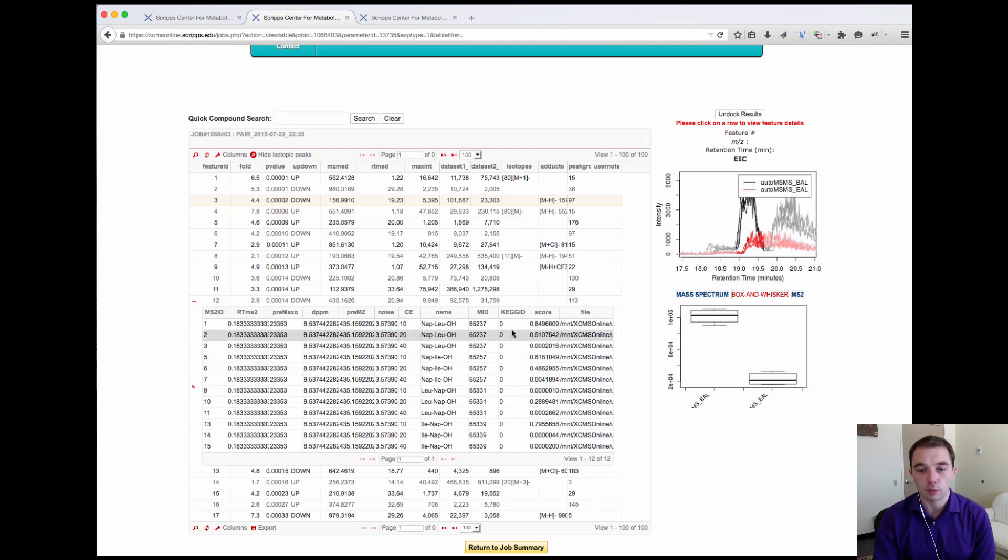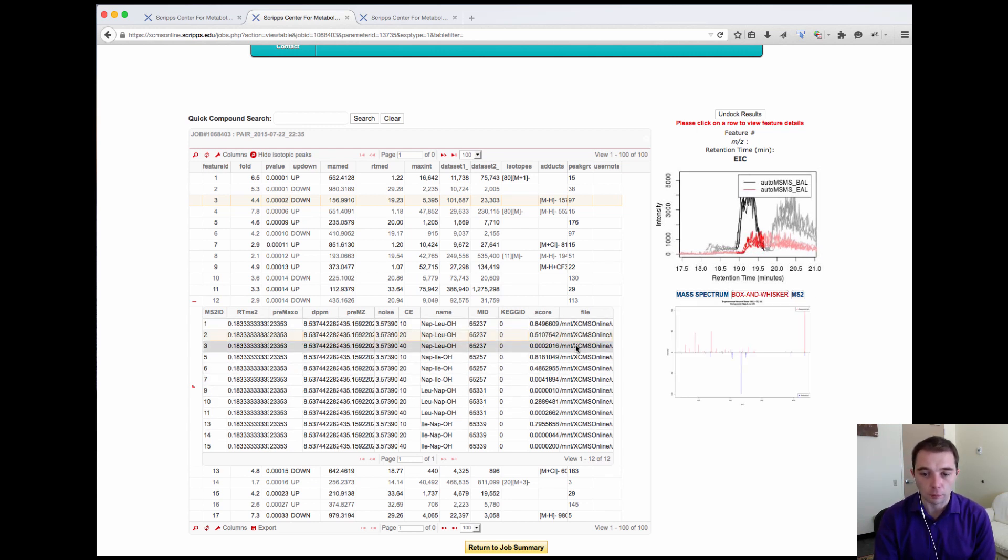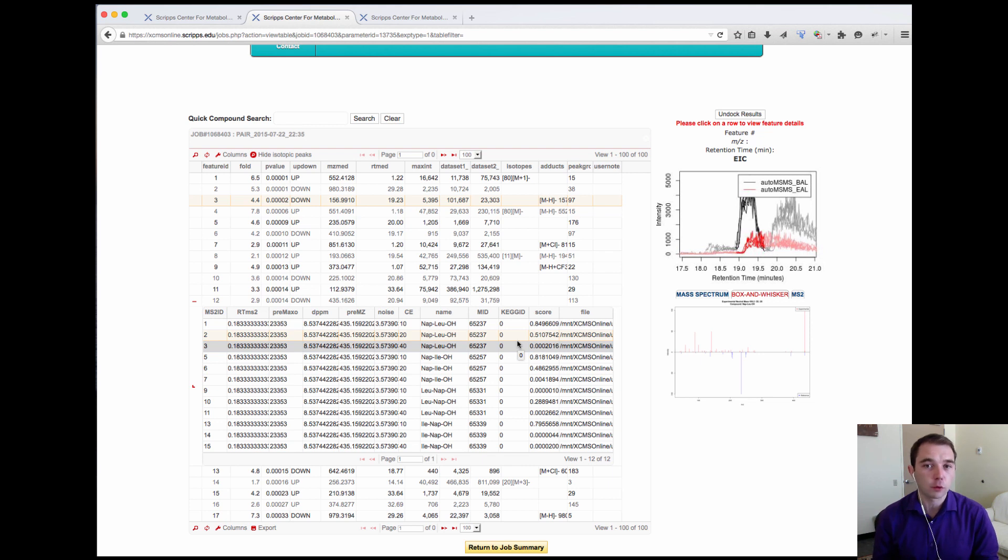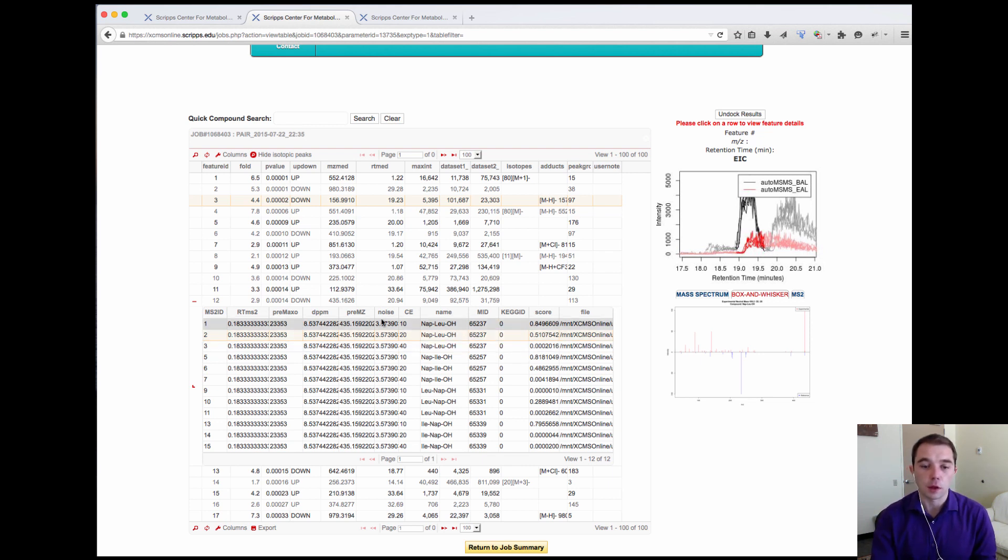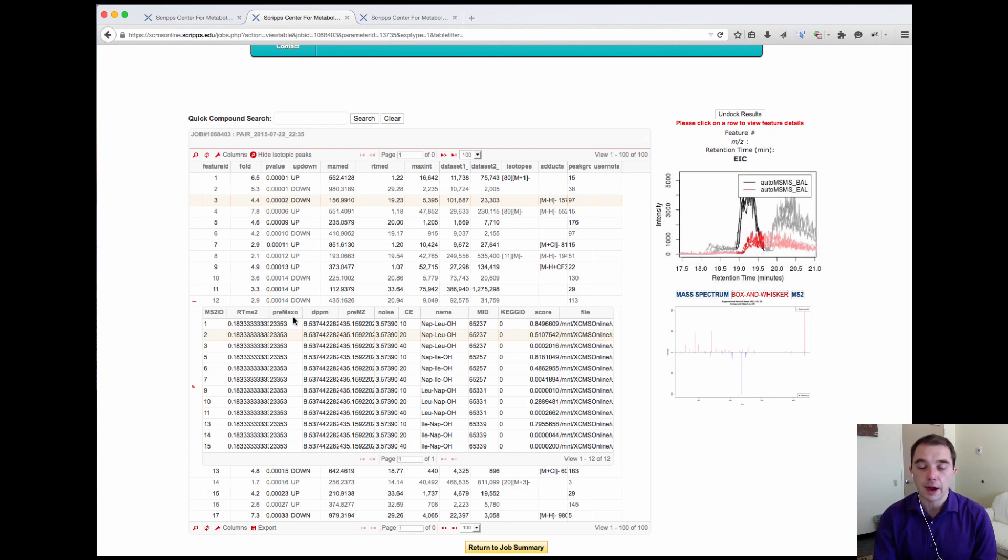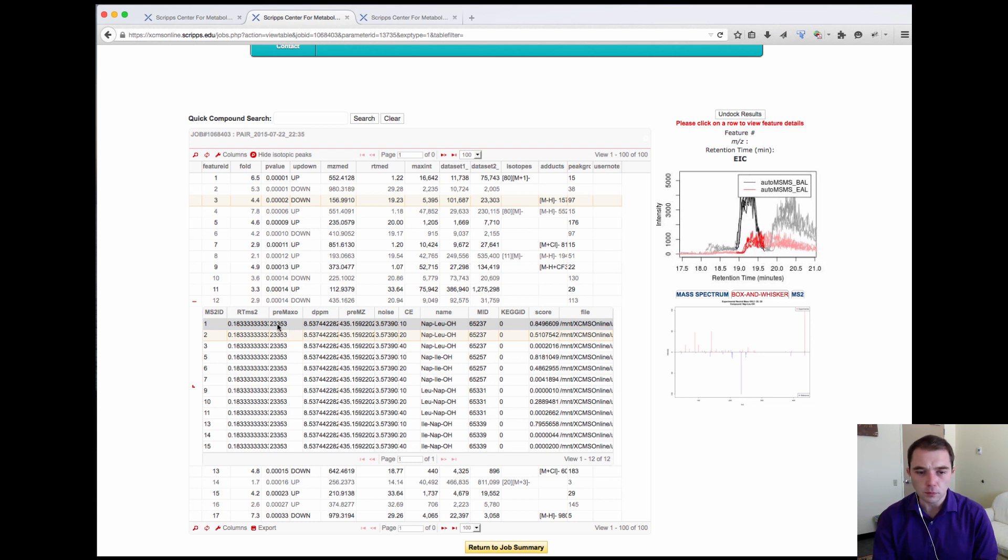It tells me what the score was for that MSMS match, the name of that compound which was found in the METLIN database, the precursor mass, the delta ppm that it was away from the database match. This pre-max O is the maximum intensity of the precursor, and then this is the retention time that the precursor was found at.